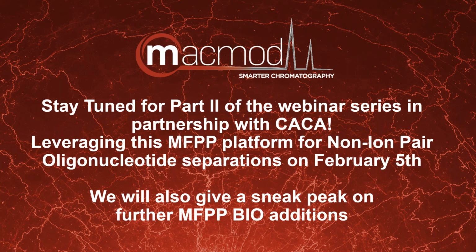Got you. So earlier you just mentioned the temperature. How high a temperature can you tolerate for your column? I mean, chromatography is a compromise. You can melt it if you want, but you're not going to get the lifetime out of it. So we recommend, at low pH for the longest lifetime, 60 degrees C at the highest, and at mid to high pH, 40 degrees C.